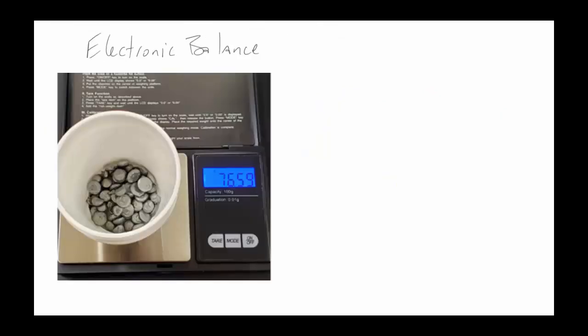All right, so one of the first pieces of equipment that we ran across in the lab was an electronic balance. And so an electronic balance is really easy. I don't know if you can read this very well, but our precision is actually listed on the piece of equipment. And you'll notice our display, this decimal point, which is not very easy to see, but it actually tells us what digit, just the display itself. So this would always be recorded as 76.59. And then grams, our units are listed up here in the top left-hand corner of this particular scale.